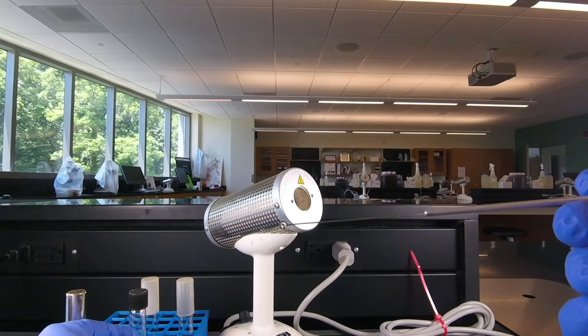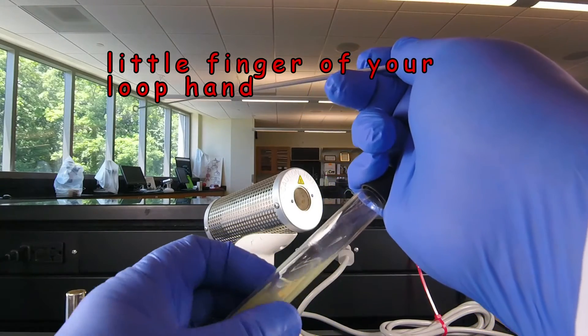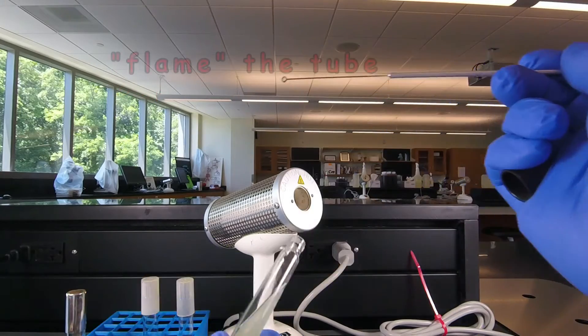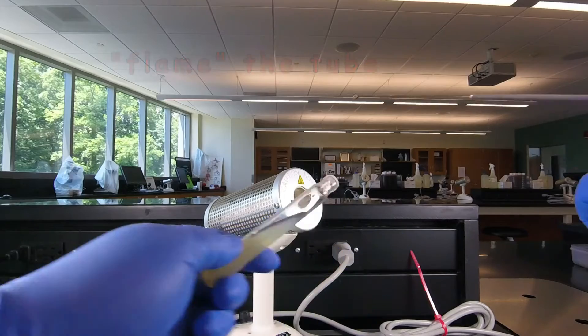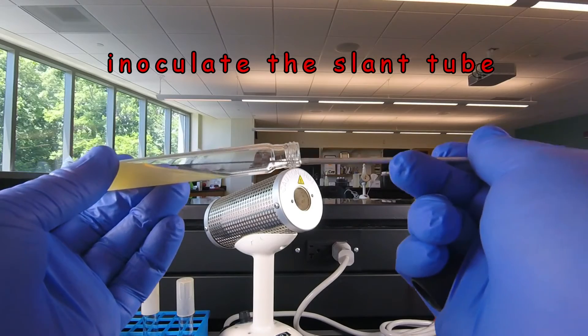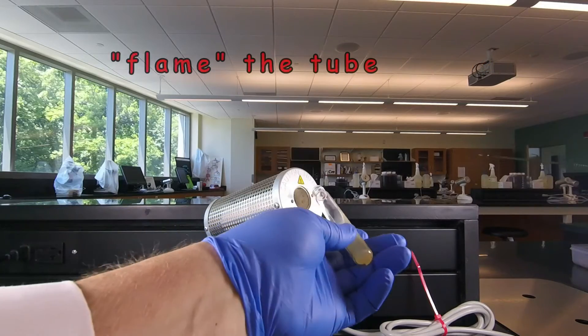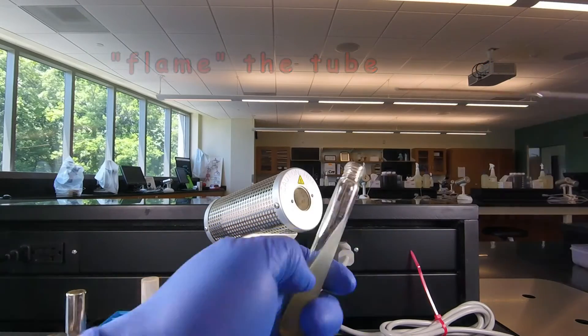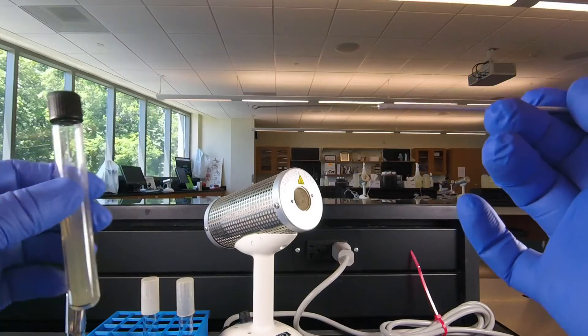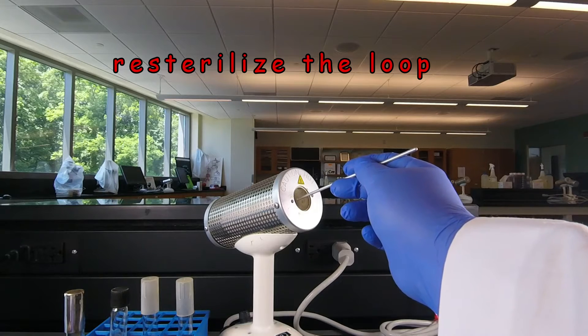We're going to streak it on a slant tube. So once again we grab the cap in the little finger of the loop hand and we unscrew it. This is a screw top tube. We flame the tube for three seconds. We're going to hold it so the agar is down flat and the loop is flat. We're going to start at the bottom of the streak and just do a little squiggle as we pull it out. Then we flame the lip of the tube for three seconds. We screw the cap back on, keeping the cap a little bit loose so that air exchange can occur. And of course we burn off any remaining bacteria on the Bacto incinerator by putting it in for ten seconds.